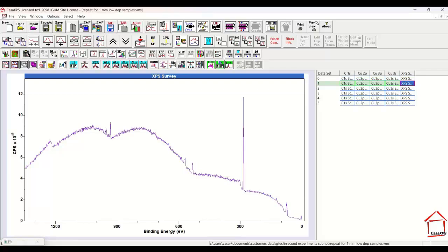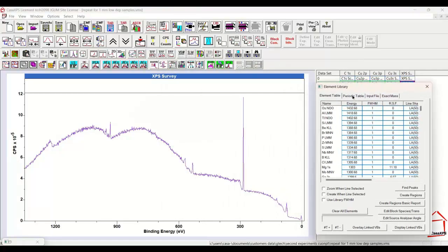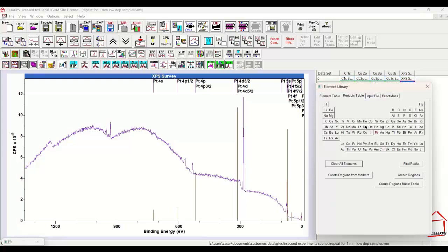However, if we go down the kinetic energy, this overlayer is producing a profound influence on the background and also the peaks. The photoemission peak for copper 3s, for example, that's about unity in terms of a relative sensitivity in terms of scope of cross sections. The copper 2p ought to be about 25 or slightly more than 25 times larger than the copper 3s, and since it has to be that much larger than this peak, and it isn't.